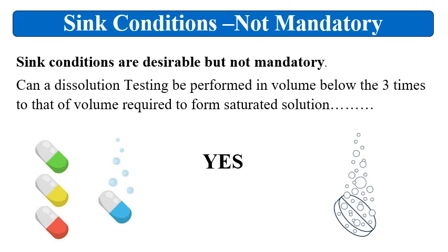See, sink conditions are not mandatory. These are desirable to have, and a dissolution testing can be performed in a volume below 3 times the volume required to form the saturated solution. Sometimes it is not possible to have the sink conditions for those APIs for which the dose is higher and the solubility is very low.